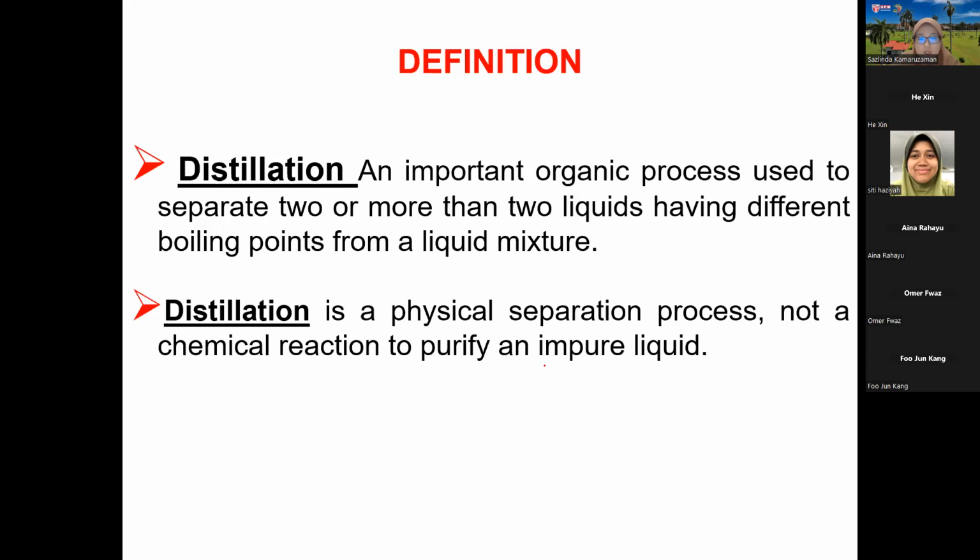So I think it is quite similar. This is the one we already talked about a few minutes ago, where we talked about distillation. It is a very important organic process because it involves organic compounds, organic molecules, to separate two or more. So it can be more.